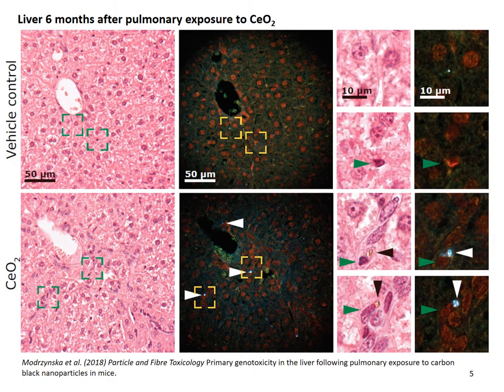This first example is actually the same as I used in the demo just before — it's cerium dioxide in mouse liver. But I wanted to show you also the corresponding brightfield images. So here is what you saw in the demo, and this is the corresponding brightfield image. This is to give you the impression that in brightfield you would probably never find these material agglomerates, whereas they come up nicely in the enhanced darkfield.